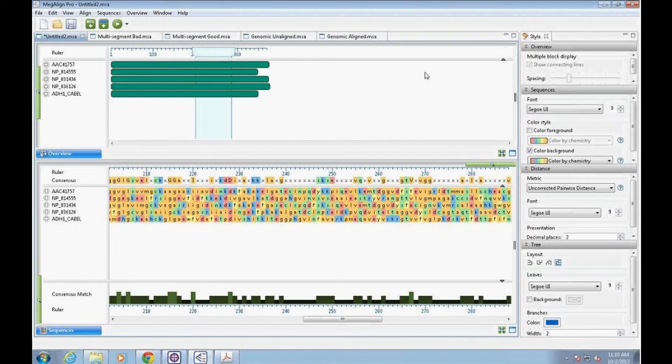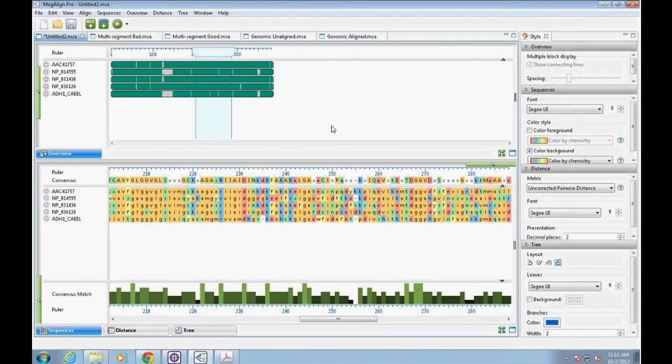Now, as I mentioned, for this workflow, we'll be aligning using the Clustal Omega algorithm. And we can do this by selecting Align using Clustal Omega, or again, going to the toolbar and from the drop-down menu, selecting Align using Clustal Omega from this drop-down command. After selecting that, the sequences have almost immediately aligned here. And if we now look at the overview again up here, we notice that the sequence blocks are now all the same length. We can also see sequence gaps within these blocks, which is represented by the gray coloring.